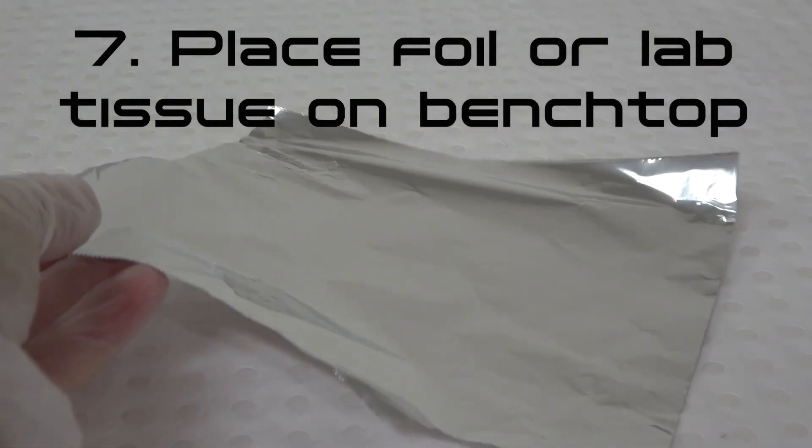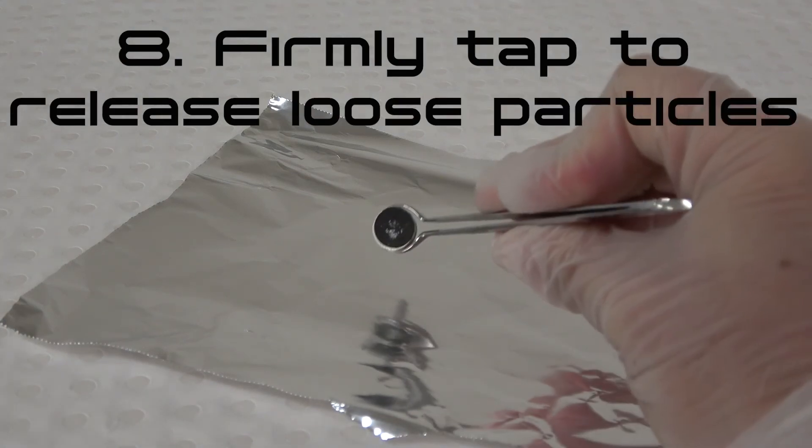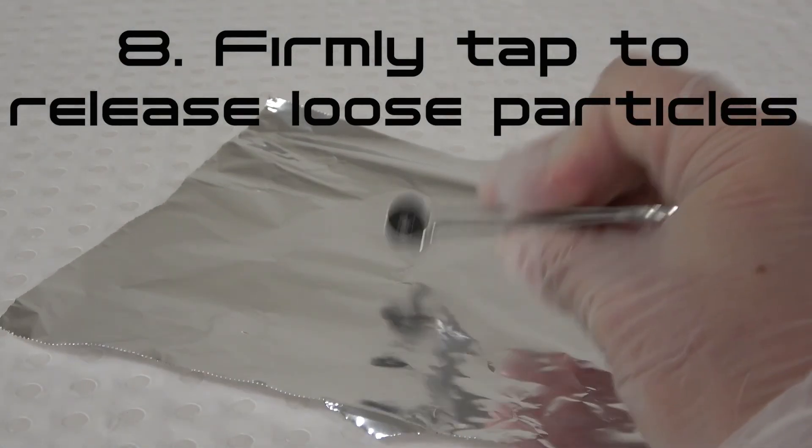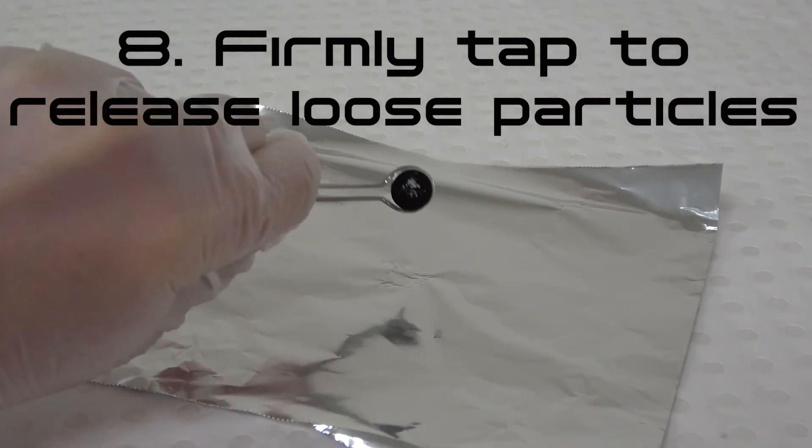Step 7. Spread a clean piece of foil or low lint lab tissue on the bench top. Step 8. Firmly tap the side of the SEM stub onto the foil so that any loose particles fall off the stub.